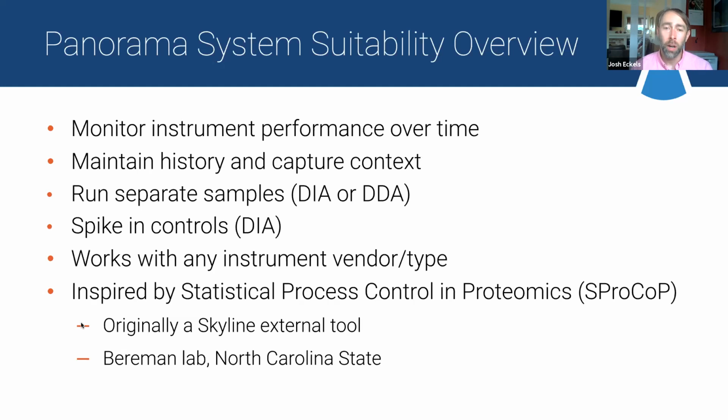One of the things we really pride ourselves on, working with the Skyline team, is that we're agnostic for the instrument type or vendor. The Skyline team works really hard with all the major mass spec vendors to keep supporting their new instruments and their new file formats, and we're definitely benefiting from that.